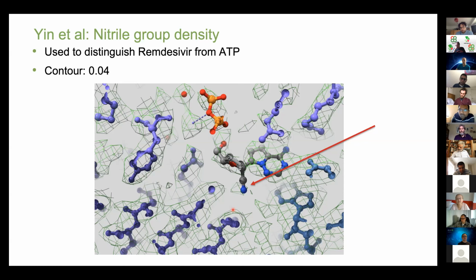What we are discussing right now, if I am correct, Ardan will correct me, is that the size of the grid for the mesh is about 1 angstrom, is it? I think so, yeah. Yes. Then we are talking of some kind of maxima, which are, for example, 2 angstrom, 1 angstrom, etc. Those blobs. And we are not sure are they real or not.